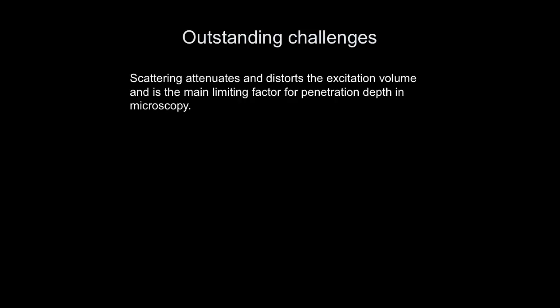So we have these beautiful techniques, these focus-based nonlinear optical microscopy techniques that have a clear advantage over confocal microscopy techniques. Confocal microscopy, which in the first place uses fluorophores, which we often don't use in NLO microscopy, is much more sensitive to scattering than nonlinear optical microscopy, primarily because of the longer wavelengths we use in NLO and because of the wide area detector that we can use. So nonlinear optical microscopy has become the standard to do tissue imaging.